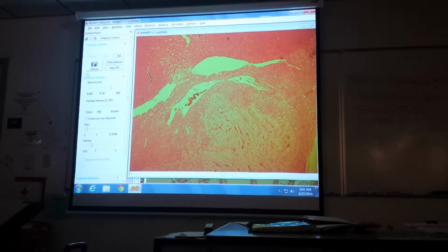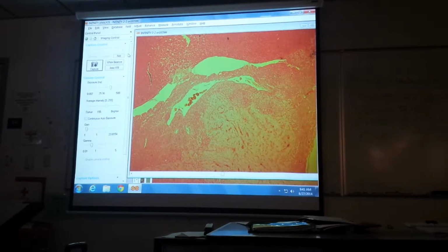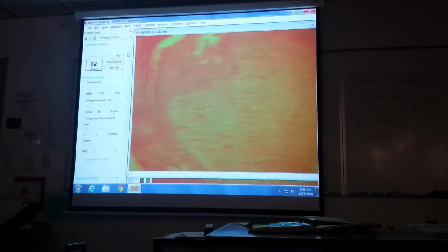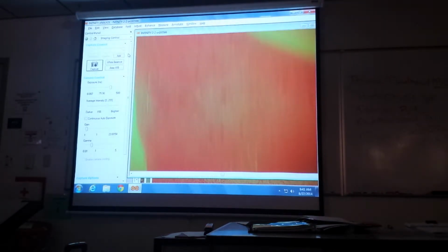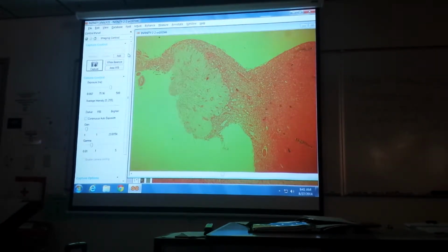Now the other thing you have to know is the pituitary stalk, or the infundibulum. Usually you have to hunt around for that. So usually what I do is I look, okay, there's the whole posterior lobe. Then I look at the side of it. That's usually where it hides. Usually that little nub right there on the top. Okay, see that there? That's a piece of what the stalk should have been. It should be continuous with the posterior lobe down there.